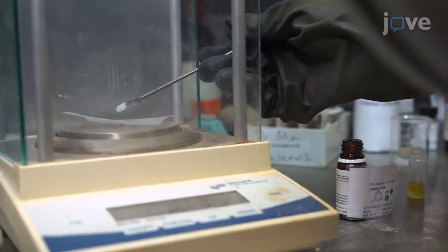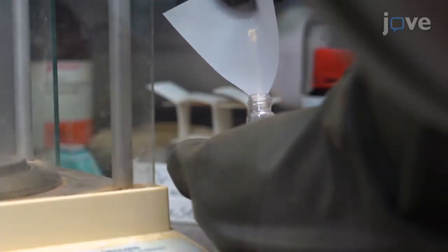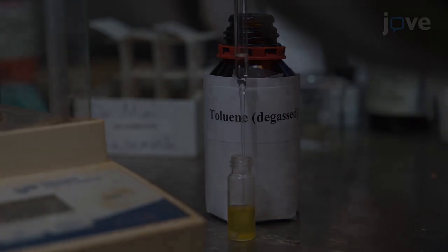Weigh 103 milligrams of 3-iodopyridine and add it into the microwave vial. Next, add another 1 milliliter of degassed toluene so that the total reaction mixture is about 3 milliliters.